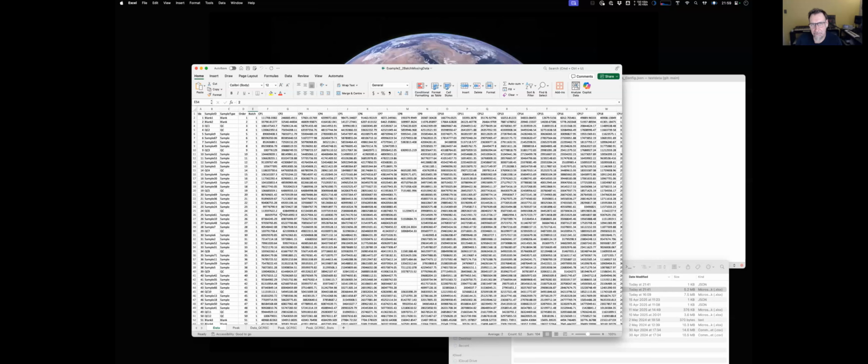Yeah, again, kind of focusing on the wrong thing. The number of samples is irrelevant. It's the number of QCs that's important. And obviously, the more QCs you have, the more robust. Ideally, you would have a QC every other sample. Well, not ideally, because that would probably mess up your data. But you could have a QC every sample, and you'd have a fantastic correction.